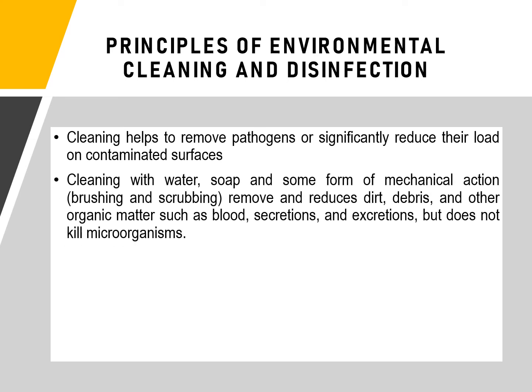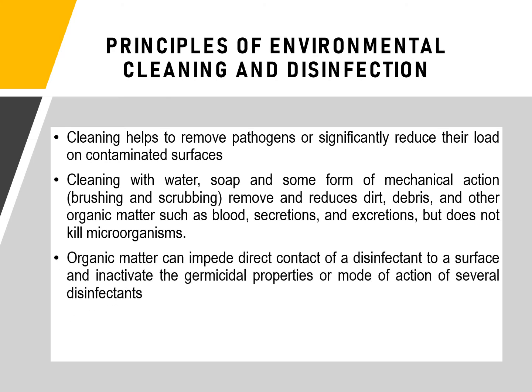Cleaning with water, soap, and some form of mechanical action in the form of brushing and scrubbing removes and reduces dirt, debris, and other organic materials such as blood, secretions, and excretions, but the act of cleaning does not actually kill the microorganism. It is the application of the disinfectant that kills the microorganism.